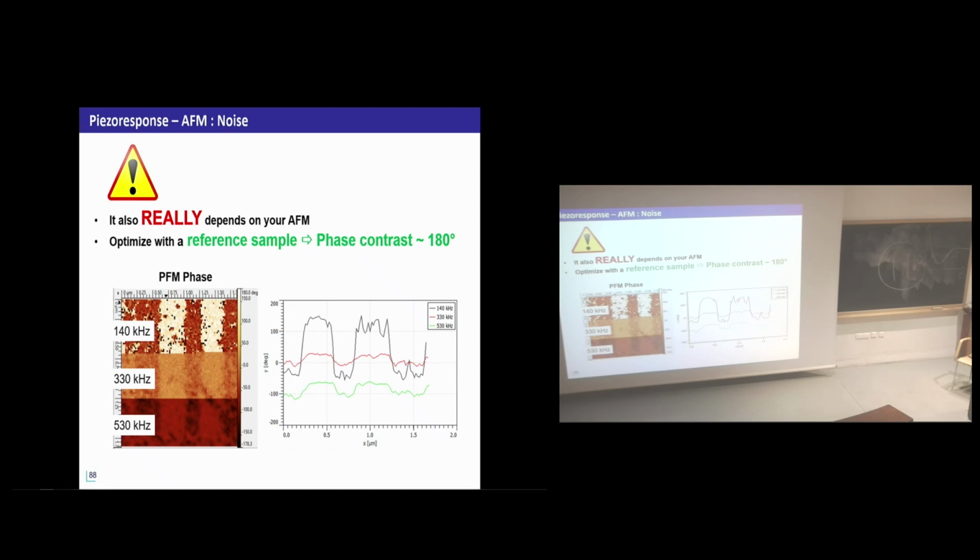Okay, we did that for PVDF, for example. Very thin, very low piezoelectric signal. So when you have no choice, of course, you use it. But most of the time on oxides, we don't use it. Even on very thin films, I'll show you later on, even on one nanometer of BTO, we didn't use it.